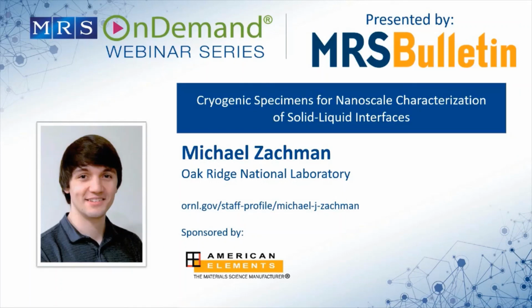But we still see through those in STEM because the electrons pass all the way through, and the material's thinner, so they can still show up dark. So some of them we don't see as well in the FIB, but they show up more clearly in the STEM. I don't know for sure if that's what they're saying, but maybe. Okay.